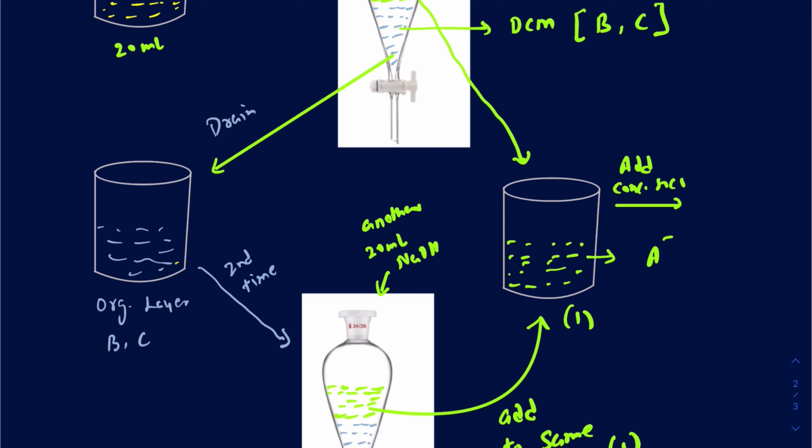And how do I really know it has been turned into an acidic solution? Obviously, you want to use the litmus paper, and right now the litmus paper would be the green one. But as soon as you start adding the HCl, eventually once the pH goes below 7 and it becomes acidic, it's going to turn into a pink and a red. So that's something you want to use to check the pH of this particular solution. All right, so I'm going to go ahead and have this here, and I'll probably change the color here just to give you an idea that when you're checking with the litmus paper, that is going to turn pink to red.